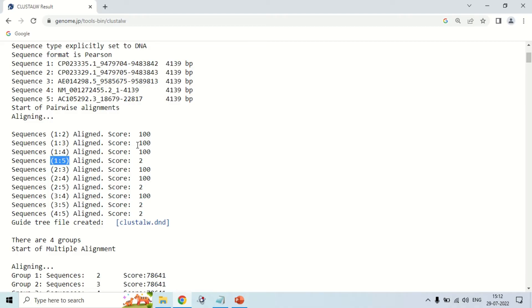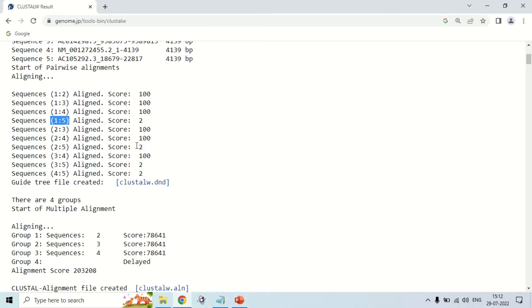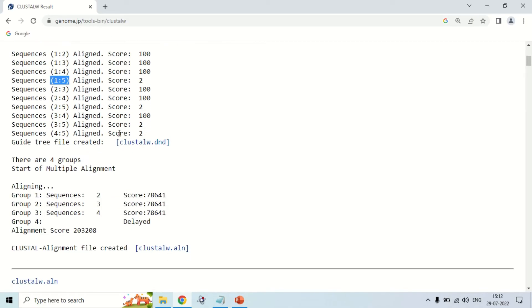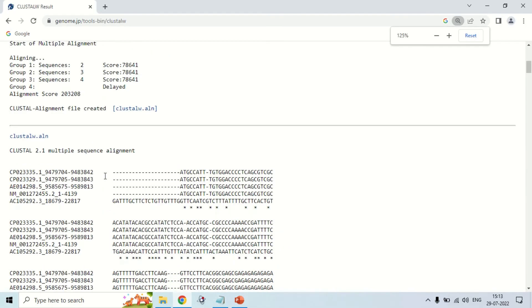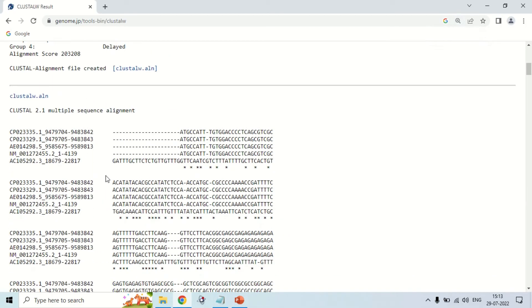In the next table, the aligned sequences are divided into groups. For example, group 1 contains two sequences, group 2 contains three sequences, and group 3 contains four sequences. Now let's come to the main alignment result, which shows the alignment of all five sequences.